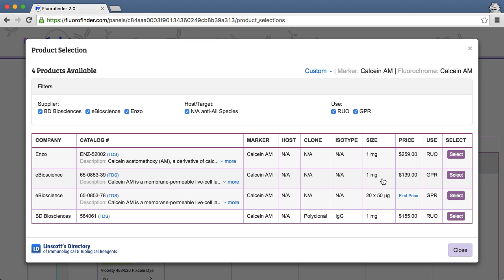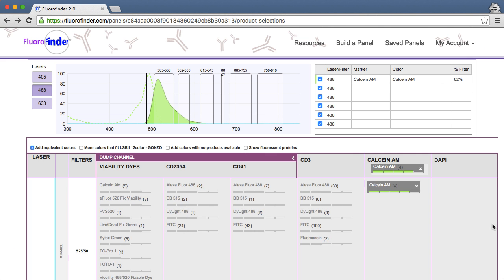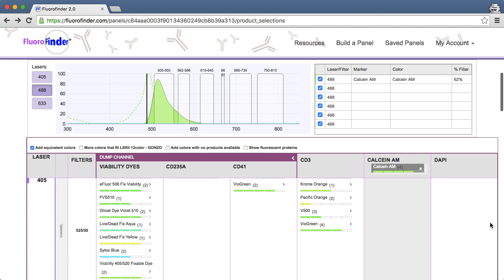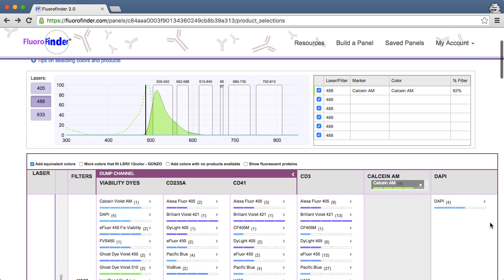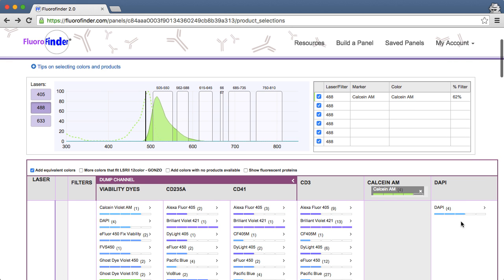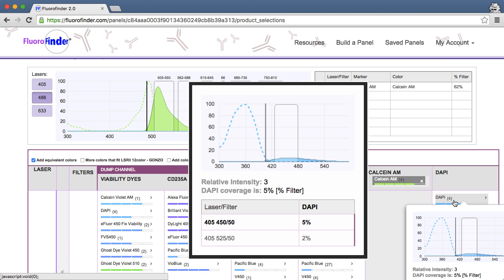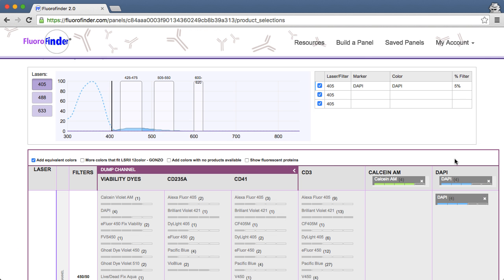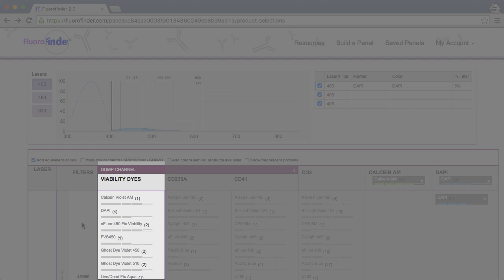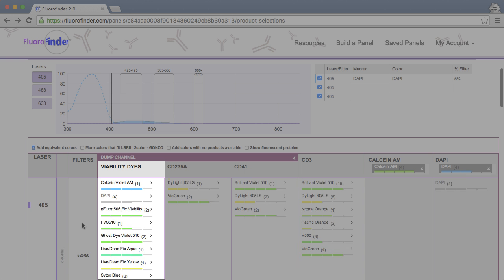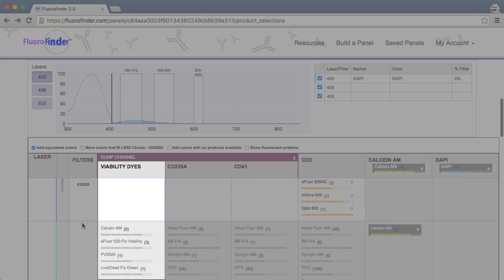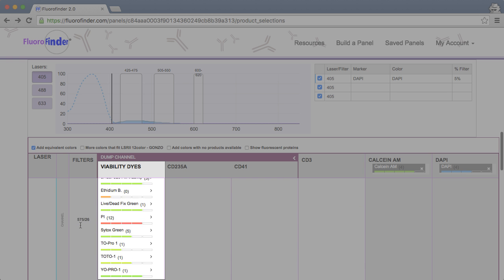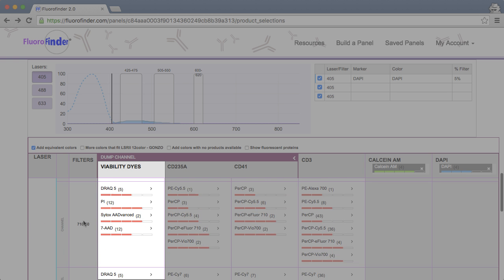Using best practices in panel design, viability dyes are generally selected after choosing your antibodies. As you assign your dyes to their appropriate channels, you can view their excitation and emission curves. When you add the general category viability dyes in step 2, you are able to select from a comprehensive list of viability dyes that work on your cytometer.